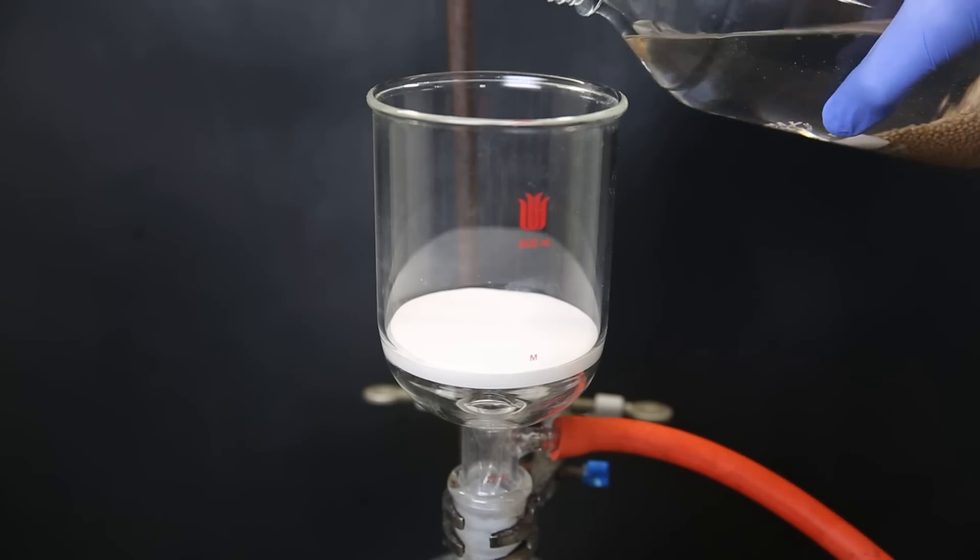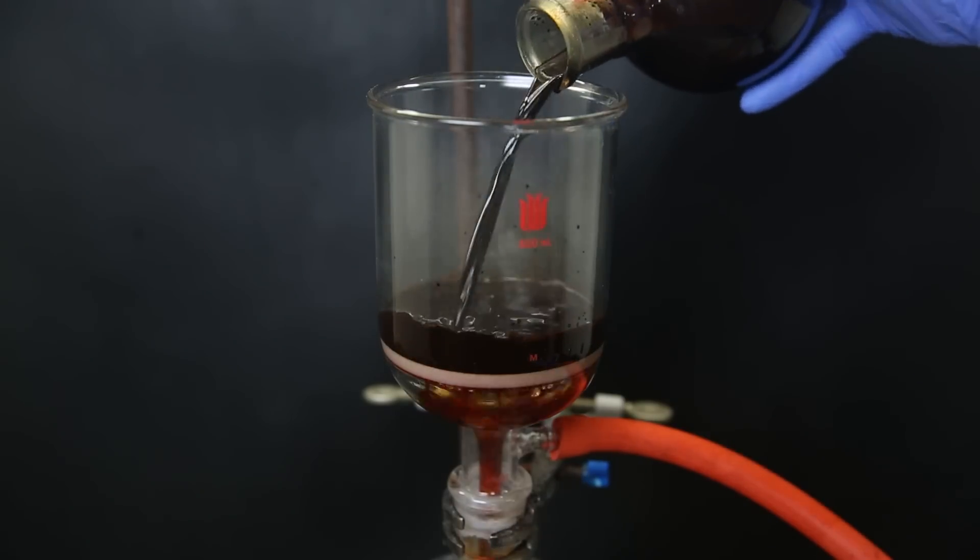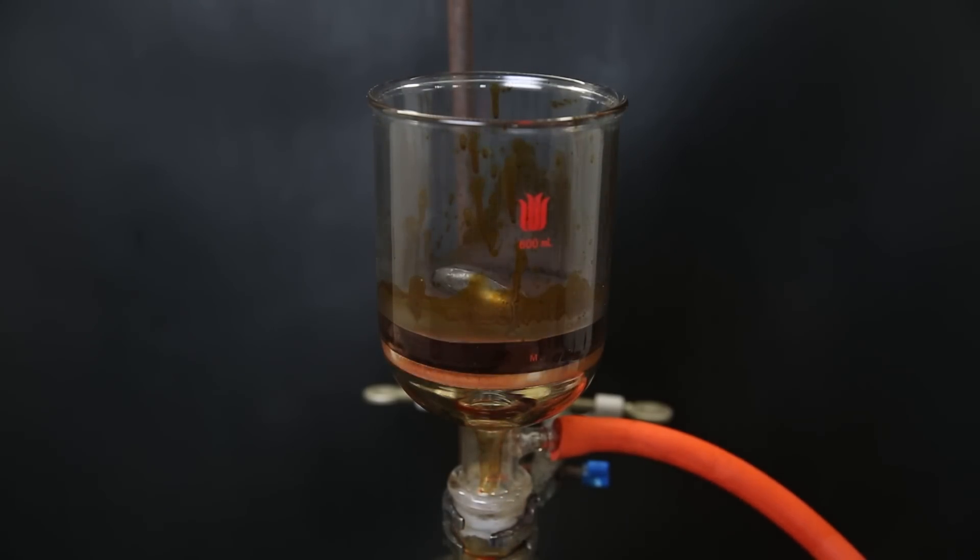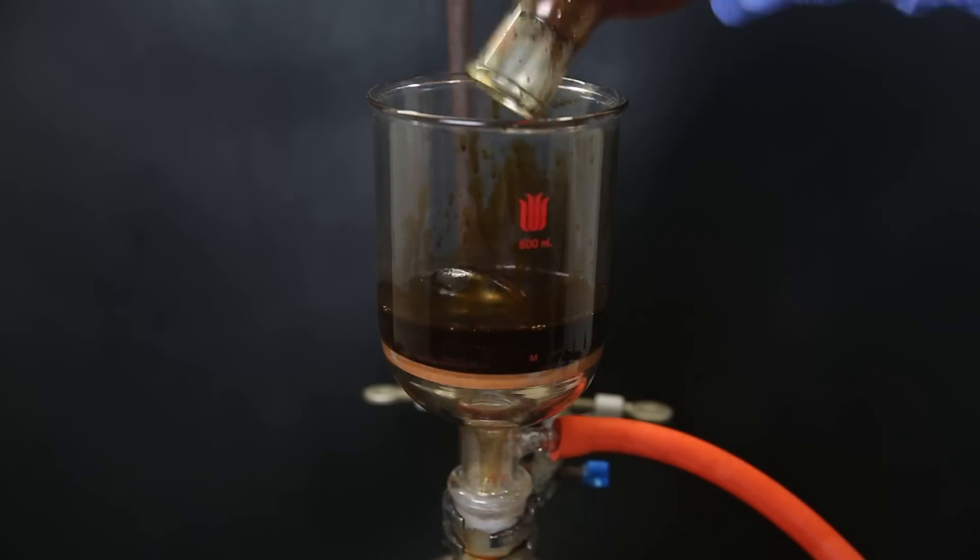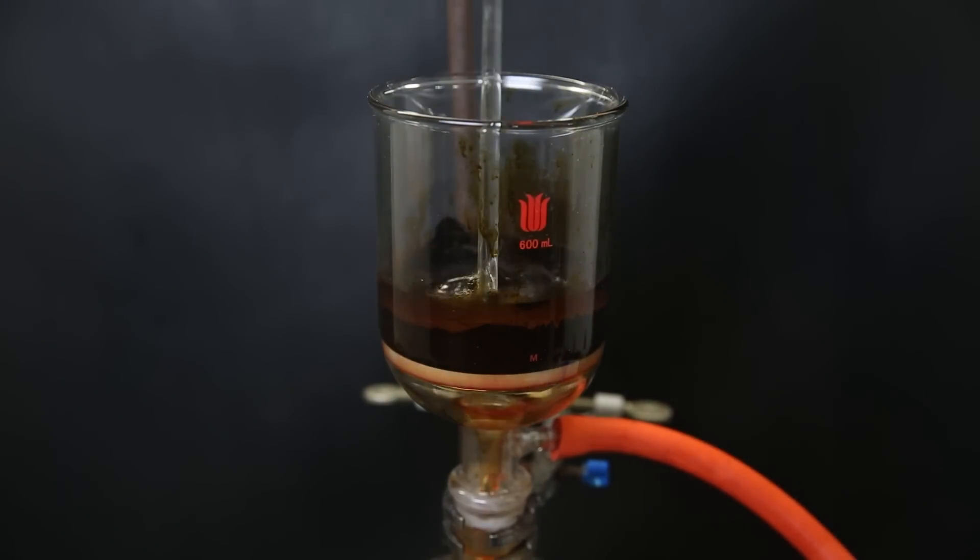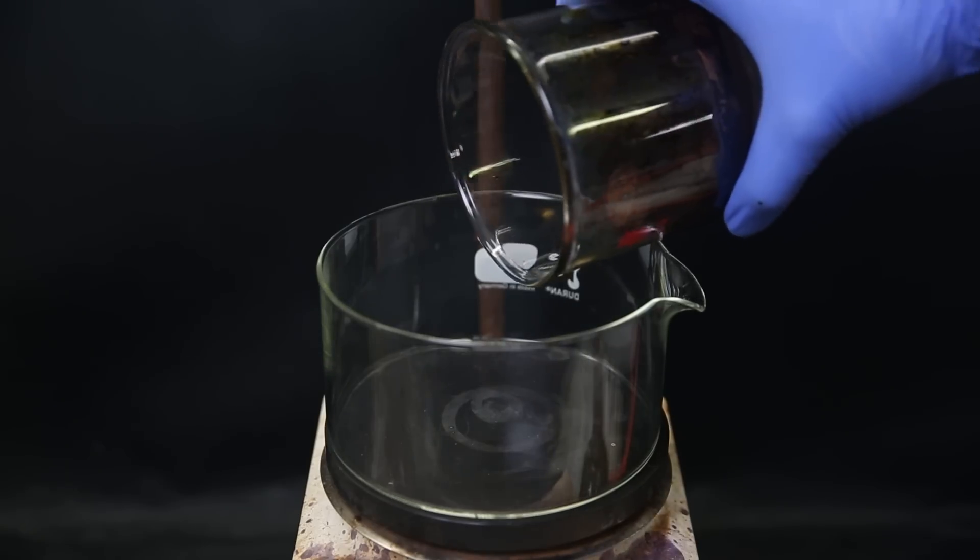So I set up a glass frit with a filter paper and wet it with some carbon tet. I then filter the whole reaction mixture through, and we can see it is still letting off some fumes. I wash out the flask with more carbon tetrachloride, and also wash the residue with more carbon tet. I stir it around and let it dry on the filter for a second, and then move it all to a crystallizing dish.